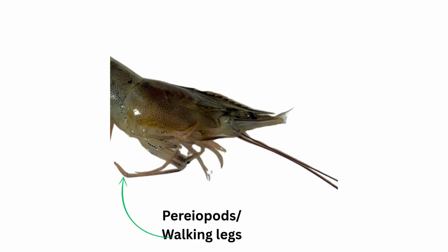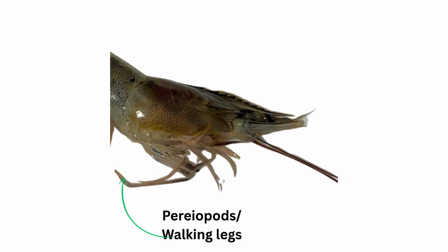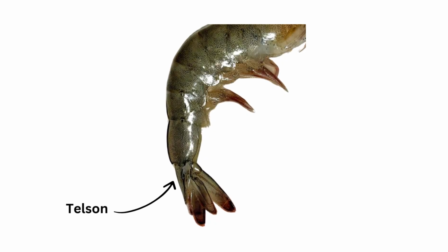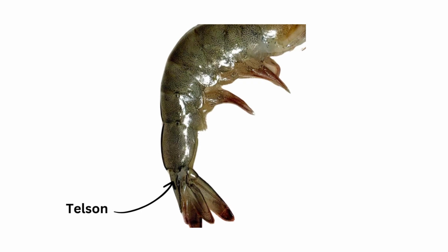Pereopods. Pereopods are the walking legs of the shrimp. Usually 5 pairs are attached to the thorax, and they are used for movement, grooming, and sometimes feeding. Telson. The telson is the central part of the tail fan at the very end of the shrimp's body. The telson helps in steering and quick backward swimming by working with the uropods.